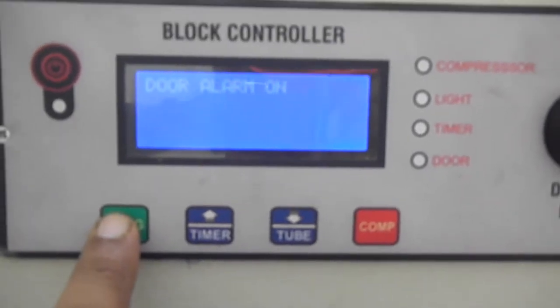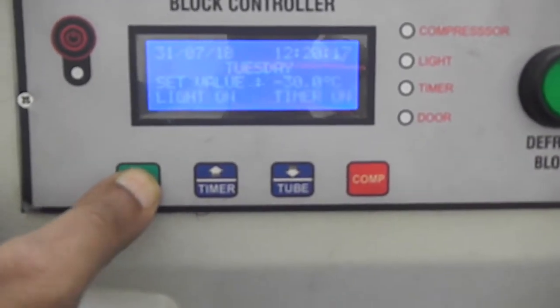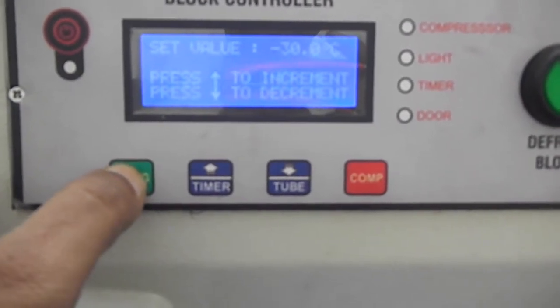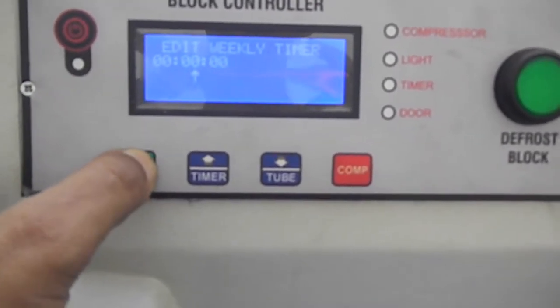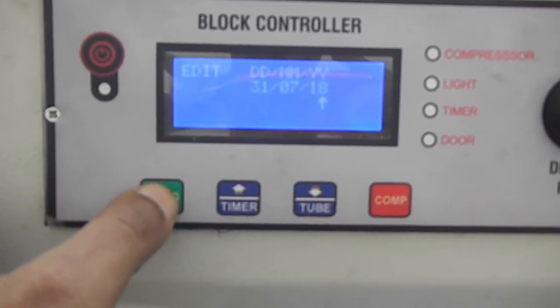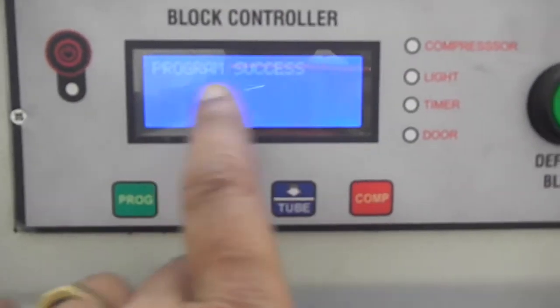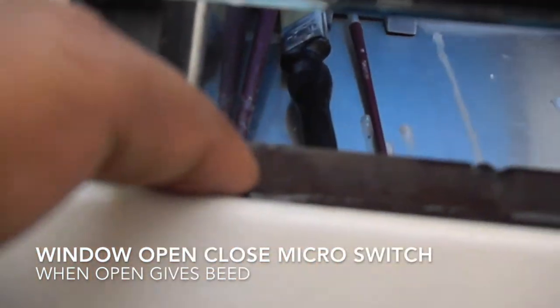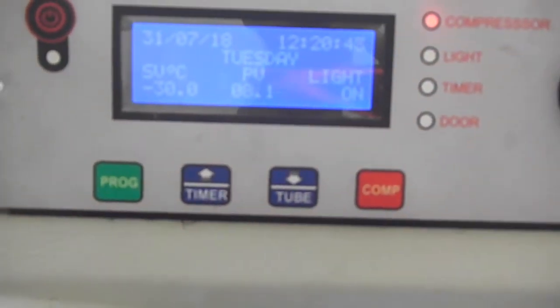Then you can set the program, alarm of the door, weekly, days, temperature is set. It should be complete when you are setting the weekly program and date. I have set it, now the program is successful. After this, you have to switch on the compressor. There is a micro switch here. If you switch it on, this indicates an alarm and the door is open.